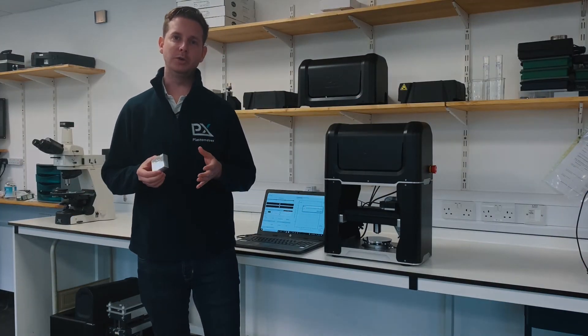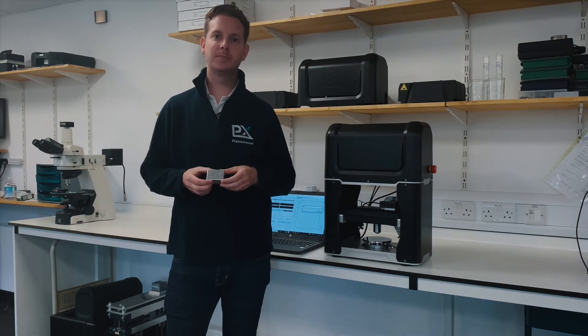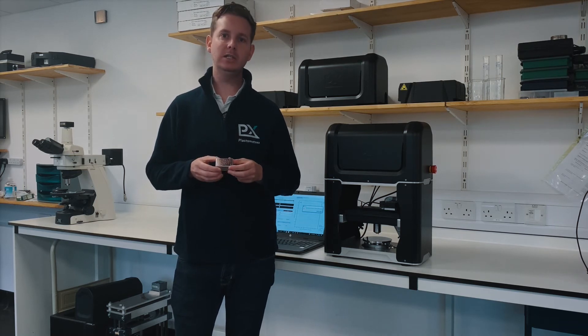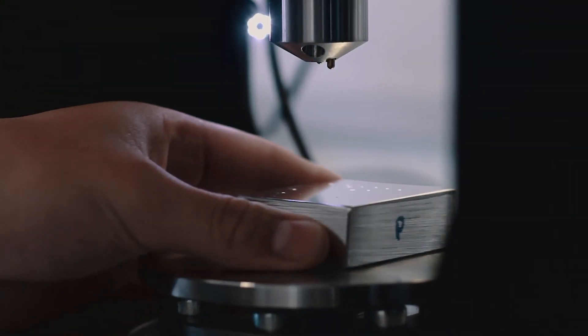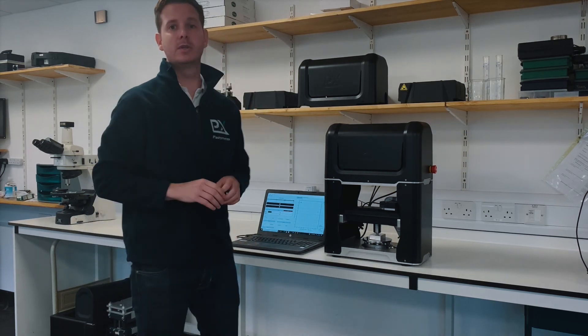So I'd now like to show you just how quick and just how simple indentation plastometry really is. Here is a piece of aerospace grade aluminium alloy that we're going to test, and all you need to do is place the specimen underneath the indenter head and then press the start button on the software — and that's it.